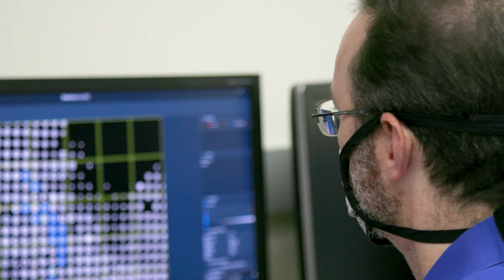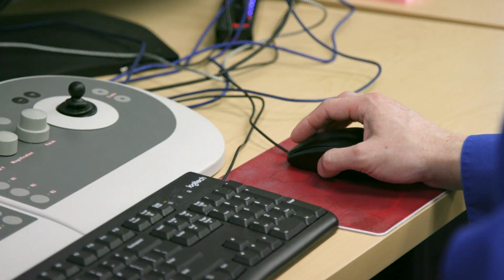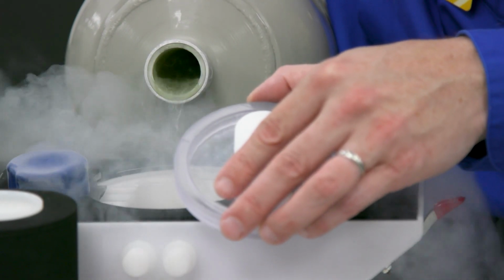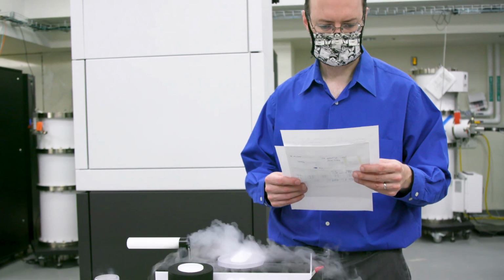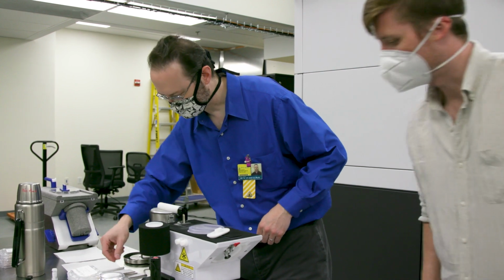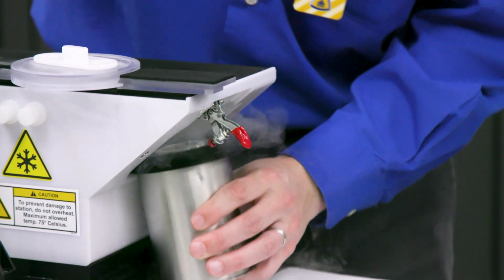And the Beckman Foundation has really been a pioneer in supporting science for science's sake. And at Hopkins, that's also in our DNA. Hopkins is really built on the idea of conducting scientific research in the knowledge that information ultimately is a good thing and it's powerful and you can do things with it. And down the road, that information can be translated. We can do practical kinds of things with our discoveries, but first you have to learn it. And that's what the Beckman Foundation allows us to do, is to acquire the instrumentation necessary to really make discoveries that haven't been made before.